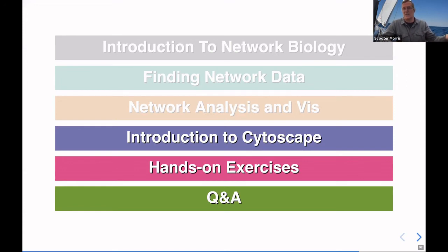So, sort of two different ways to look at this. That's great. Can I compare two networks? For example, when I knock out one of the nodes, look at this: when I knock out this node, the network changes completely. So then I can just, I don't know, can I do that?